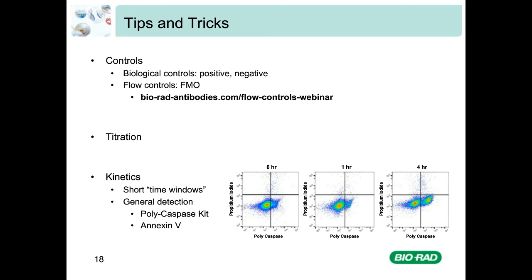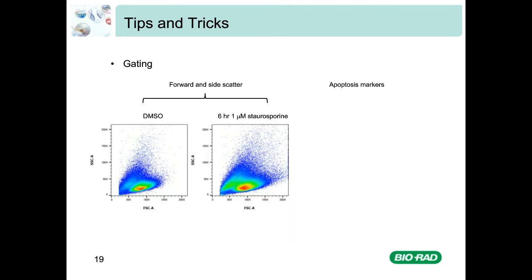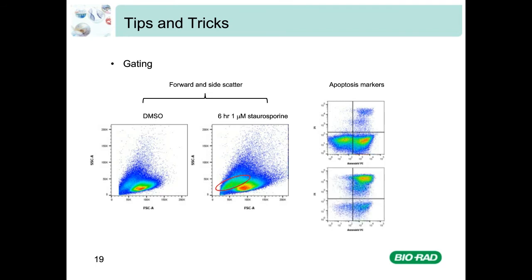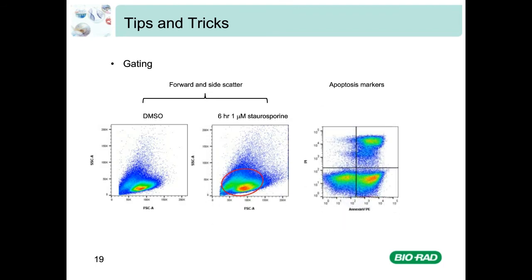Another thing to consider is gating — be sure you know where to set gates. This example of Annexin V staining of Jurkat cells shows how gate placement can alter results. If you gate only on the main population seen in the DMSO control, it may appear there are few late-stage apoptotic or necrotic cells in the upper right quadrant. If you gate on the cells to the left of this population, you can see this is where all the dying cells sit in the forward and side scatter plot. Therefore it is vital to have a large gate to include cells in all stages of cell death, with consistent gating throughout your experiment. Be aware that cell size, shape and refractive properties may change during apoptosis.